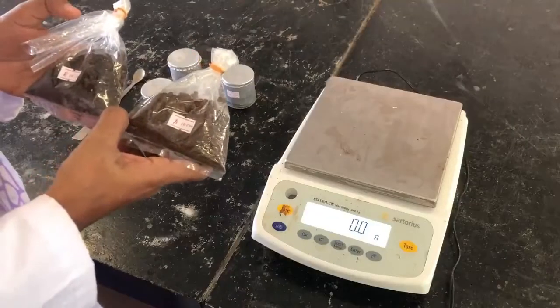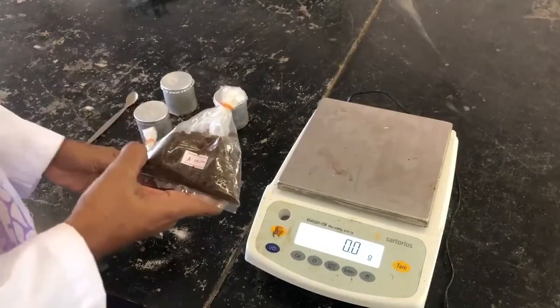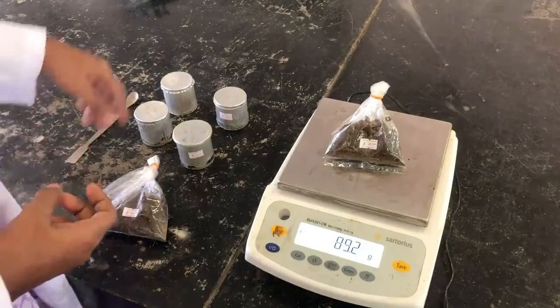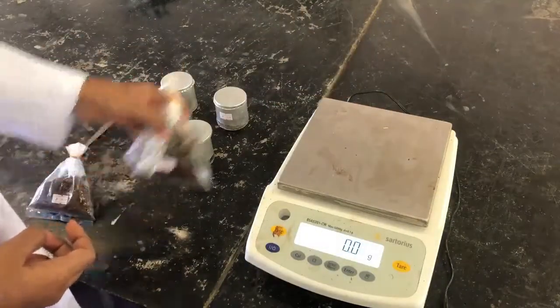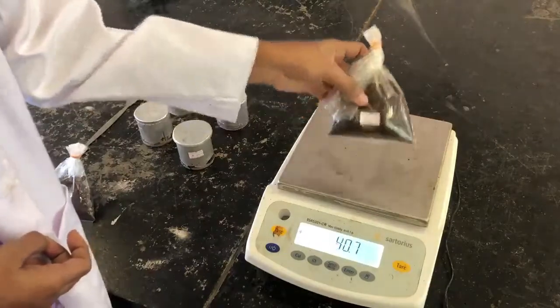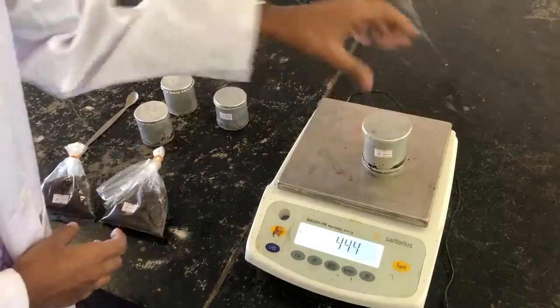Now we have the two soil samples collected in two different locations at 10 and 20 cm depths. We will measure their weight one by one. And you have to record the weight. After this, we have to measure the weight of empty moisture can.